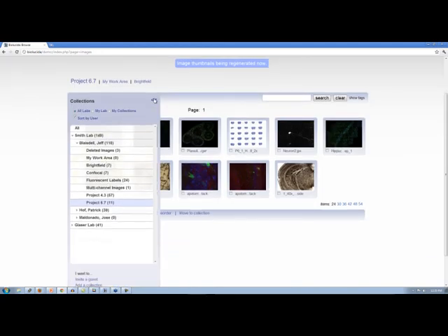Now, Jeff, we're talking about really large files here, so when you say move, they're not actually being moved or copied inside the cloud, right? Exactly. Those images were just moved in your collection. They're stored as associations within the database, so you're free to move them as you see fit. In fact, if you notice in the dialog that had popped up there, I had also an option to copy. Right. And I could have copied those images in.